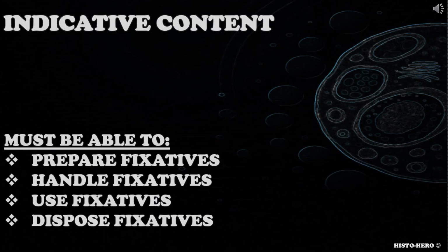Indicative content also highlights skills the candidate is expected to be able to do. The candidate must be able to prepare, safely handle, safely use, and safely dispose of a range of fixatives commonly available within a histology department.